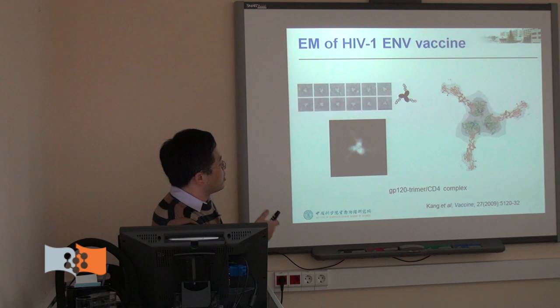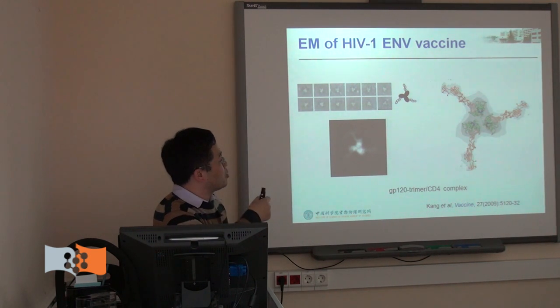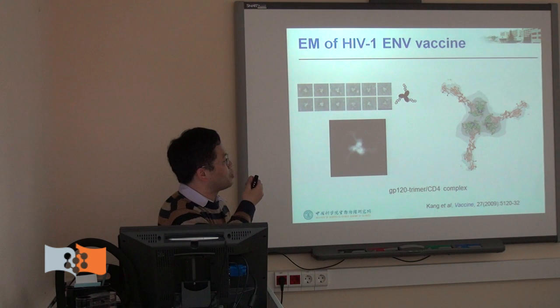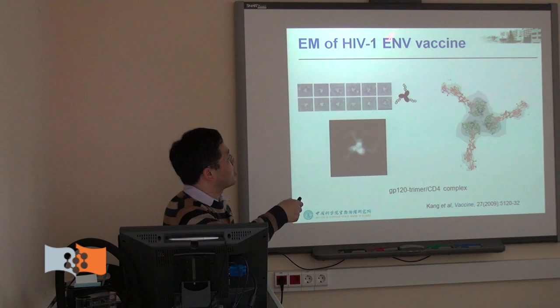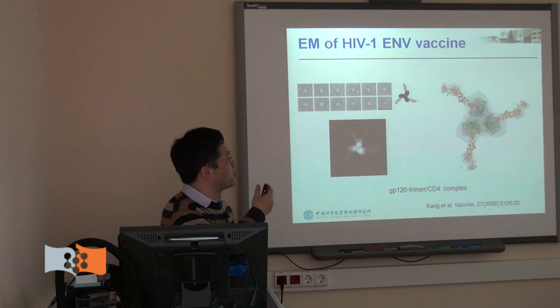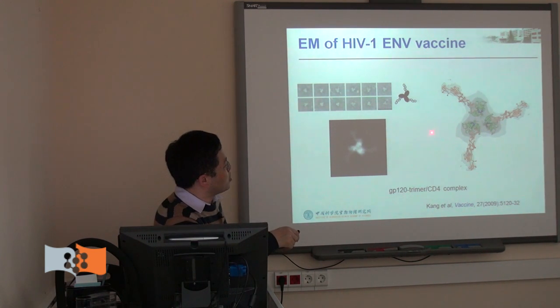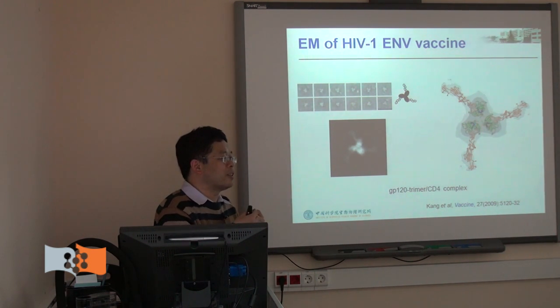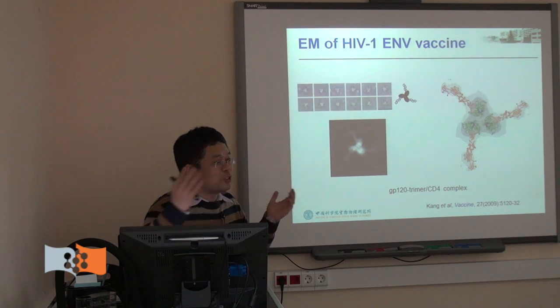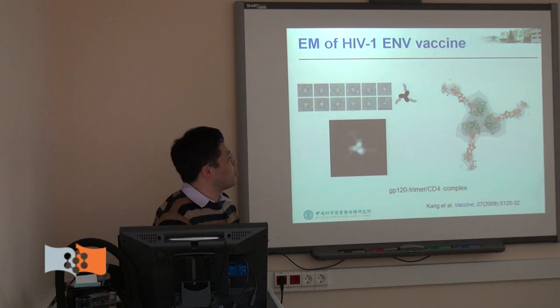So this is information about the HIV. Basically, as I mentioned before, if you want to get the envelope trimer information, the idea is to make a vaccine, to supply information for the vaccine design. There are some companies or labs that we are collaborating with. They are making envelope trimers, but they are just using chemical assays, for example combined with broadly neutralizing antibodies, but they really want to see how their trimer looks.